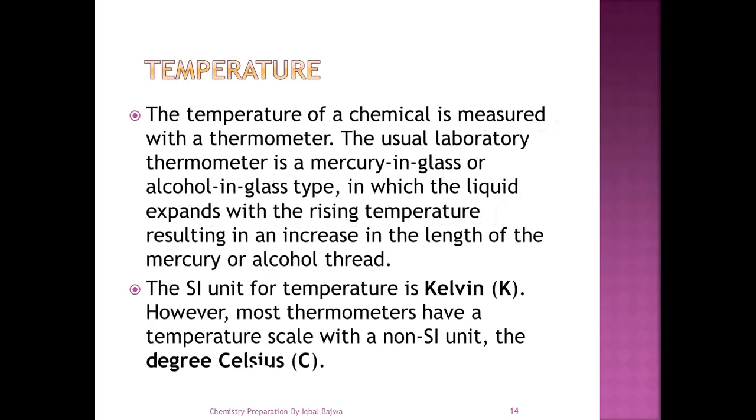The next is temperature. The temperature of a chemical is measured with a thermometer. The usual laboratory thermometer is a mercury in glass or alcohol in glass type, in which the liquid expands with rising temperature, resulting in an increase in the length of the mercury or alcohol thread.